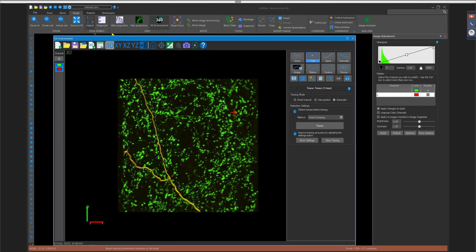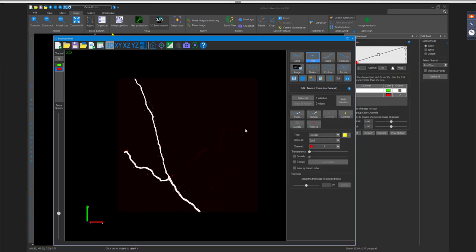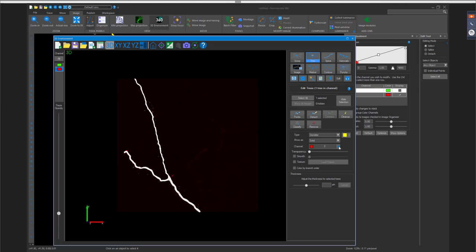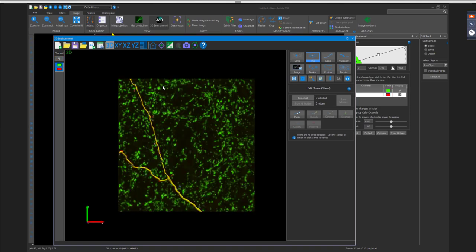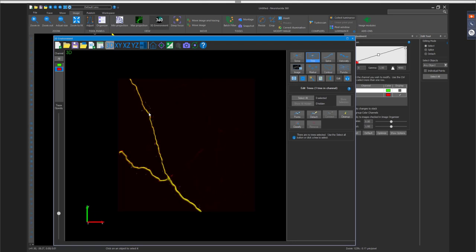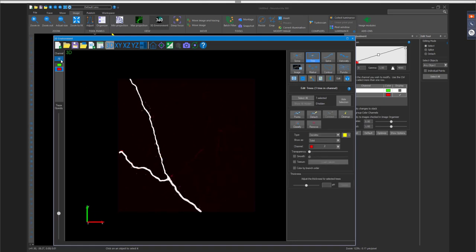Conversely, if you traced a tree in the red channel and realize it should belong to the green channel, you can go to Edit and find a 'Channel' option in the edit window to reassign it. This is helpful for users who prefer working with all data visible at once — if tracing was done without isolating a channel, you can reassign the channel association afterward through the edit panel.